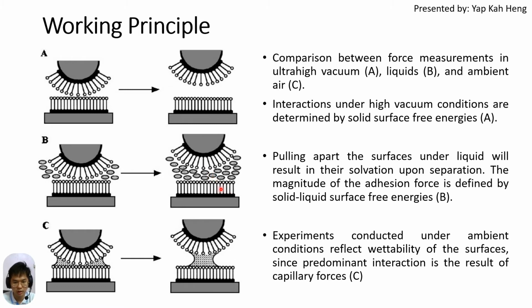So we call it adhesion force. We have the solid here and the liquid particle here, so it's two different types of particles. So it's called adhesion force. And then C. So what is the difference between figure C and figure B?